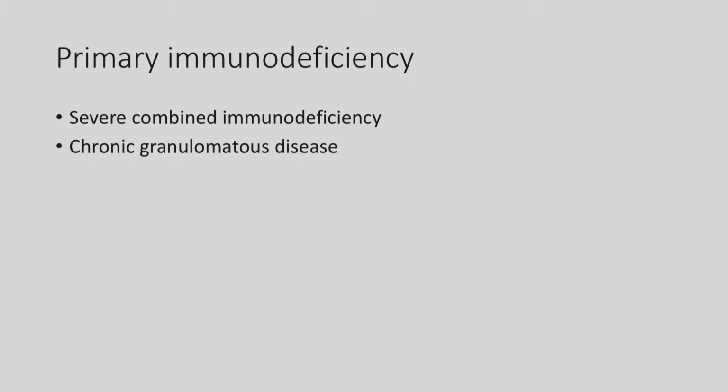Along with that, we can diagnose chronic granulomatous disease and leukocyte adhesion diseases. Most of the time, flow cytometry is a diagnostic test in severe combined immunodeficiency, but for other diseases it is interpreted in the context of clinical presentation and other tests. Nowadays, next generation sequencing is used commonly along with the clinical presentation and flow cytometry to diagnose primary immunodeficiencies.